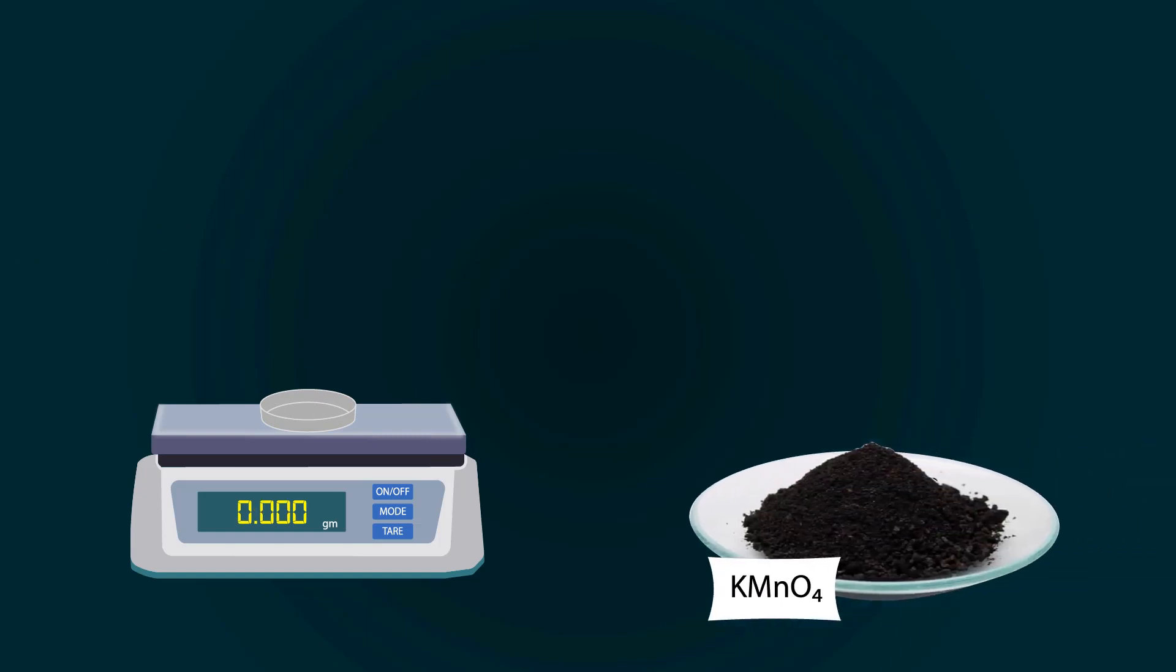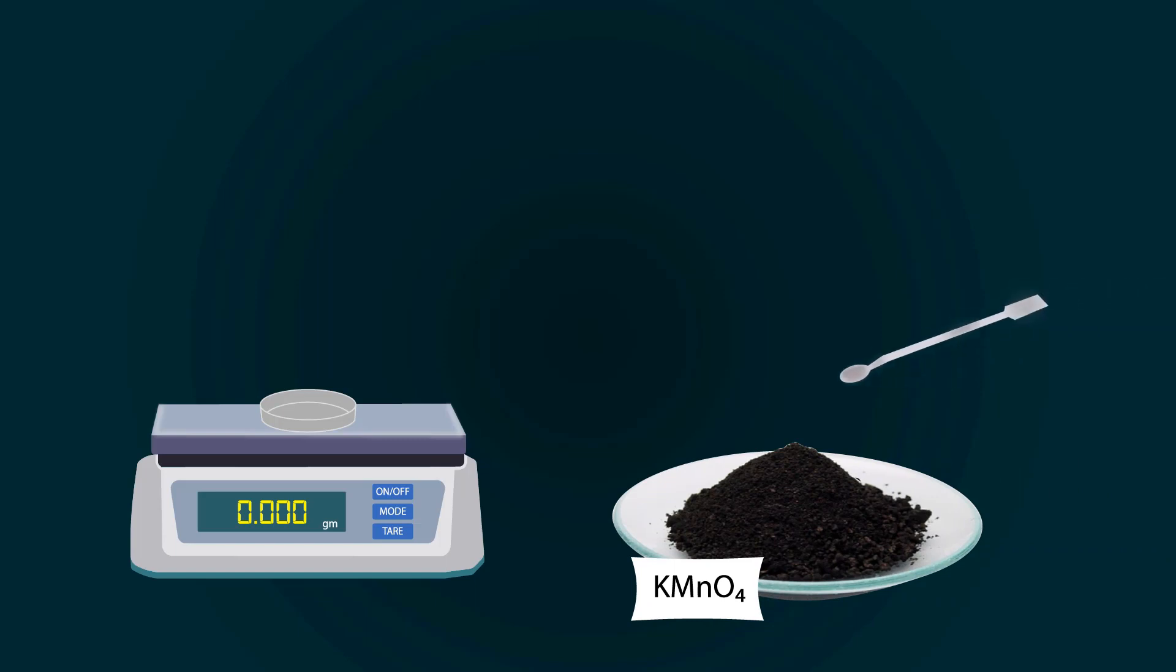First, take a weight balance and power it on. Now put the petri dish on it. Don't forget to tare it down. Now start adding potassium permanganate into the petri dish with the help of a spatula. Weigh precisely up to 7.9 grams.